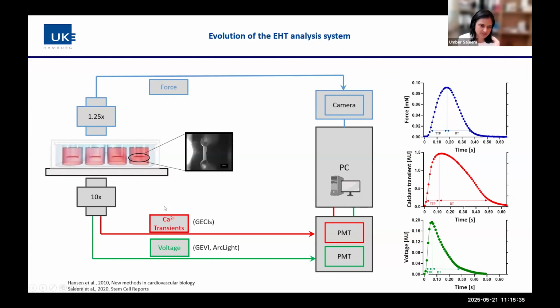Afterwards, we established an extension of this system to analyze calcium transient along with force.